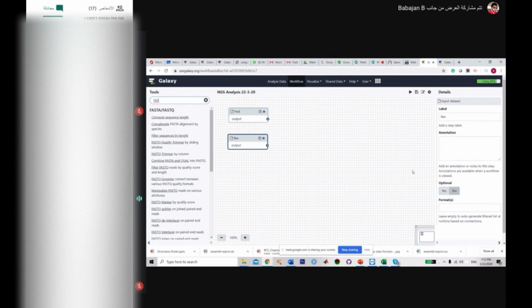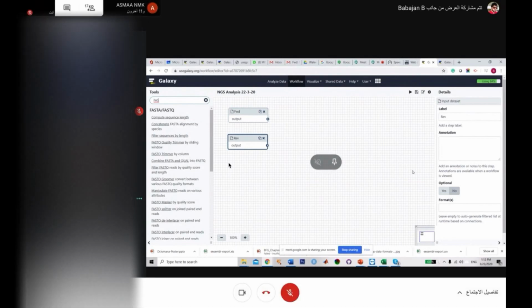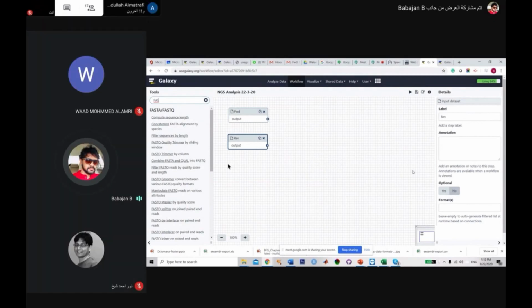Maybe you remember in the second year or first year when we were working with gene expression analysis. Always, first of all, we need to collect the data sets from the database. We have to submit to the R program and add various commands to generate an Excel sheet. Every time, for each and every data set, you have to go through all these pipelines.